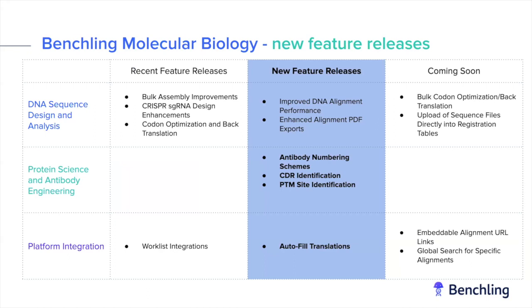In terms of new feature releases, things that have come in the last month or so, the first set of enhancements are around improvements to our alignment tool. That's actually a hot topic and theme of work for us in this quarter.